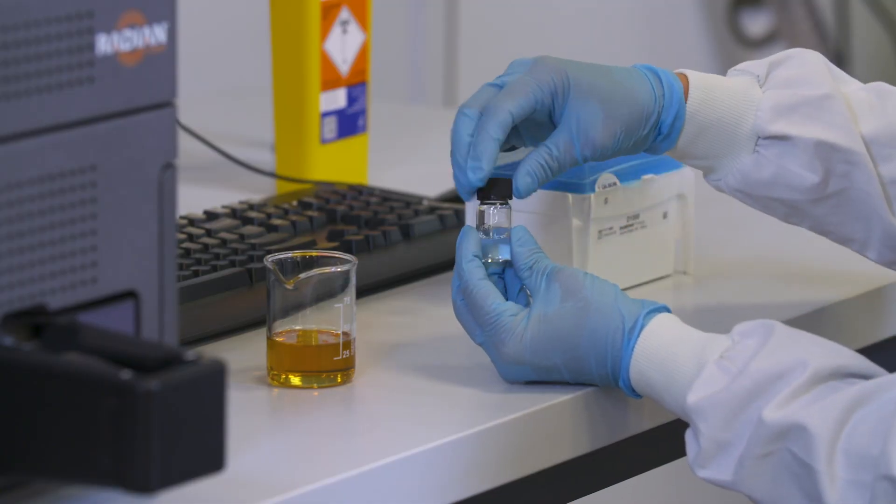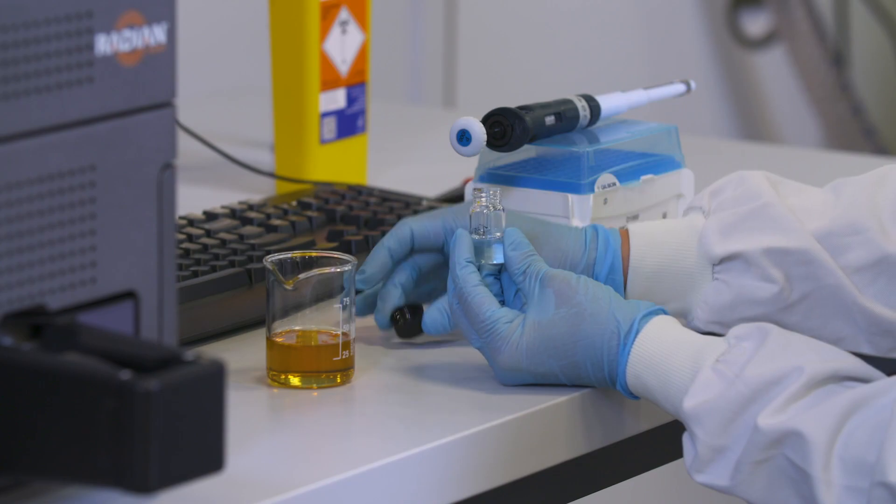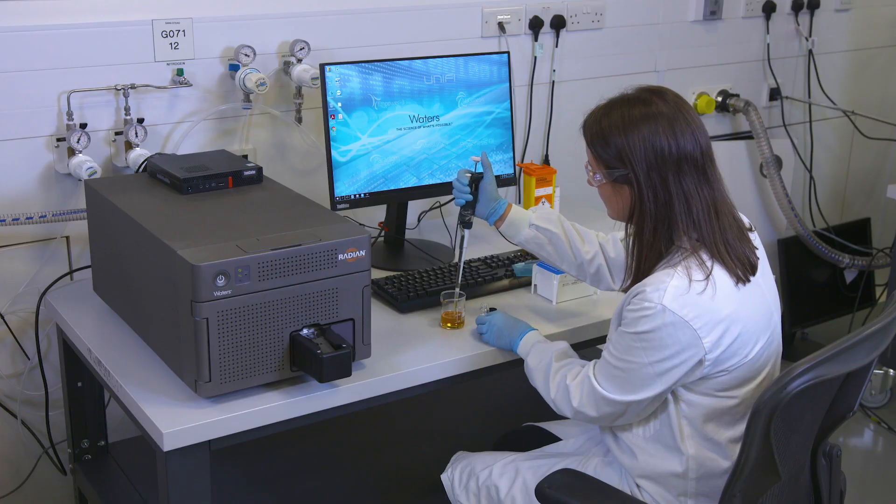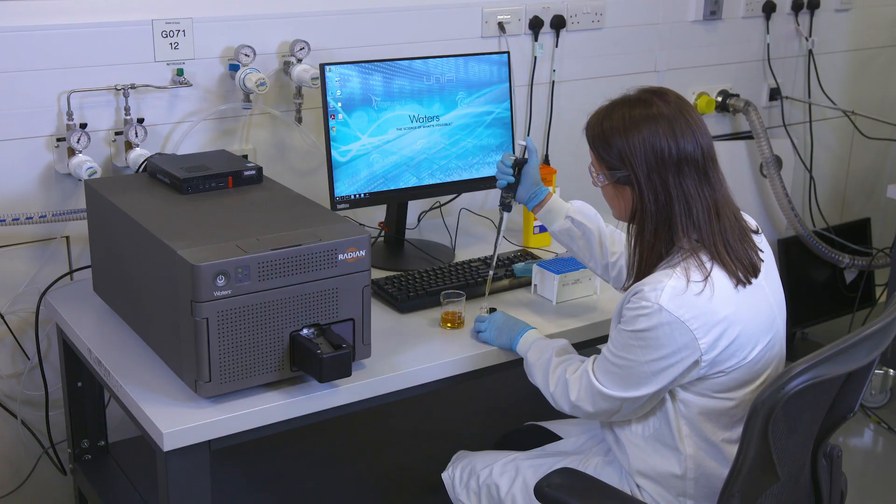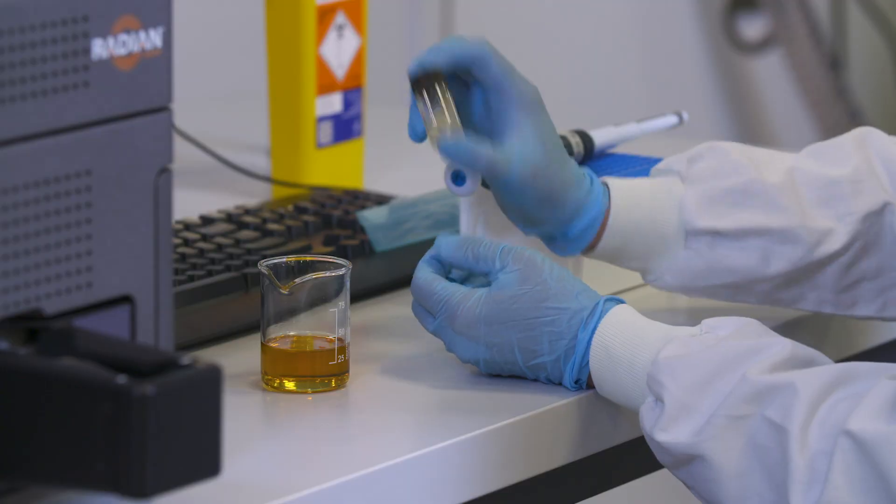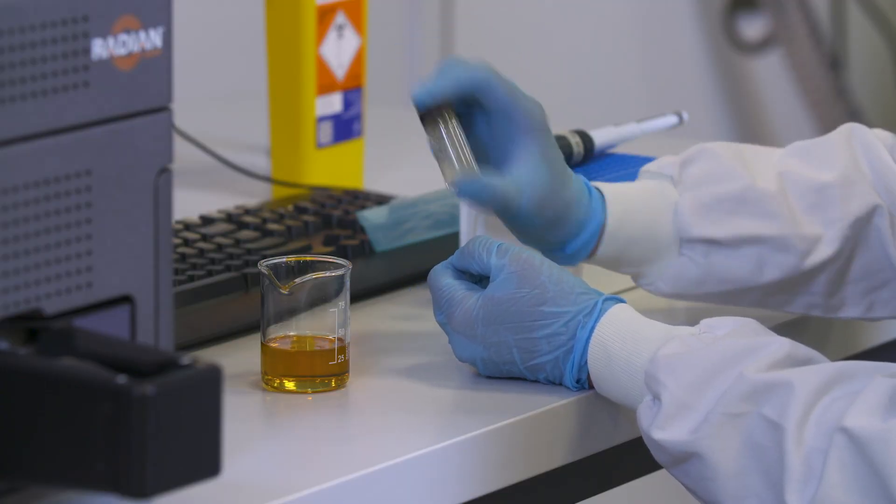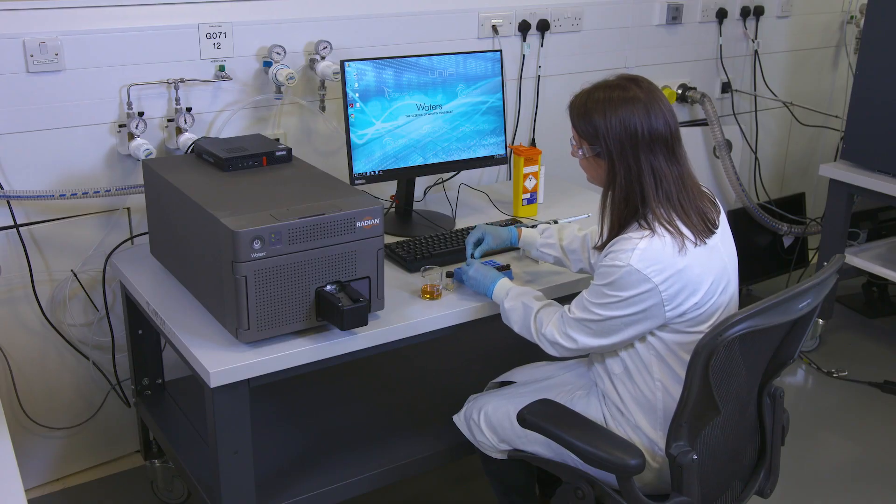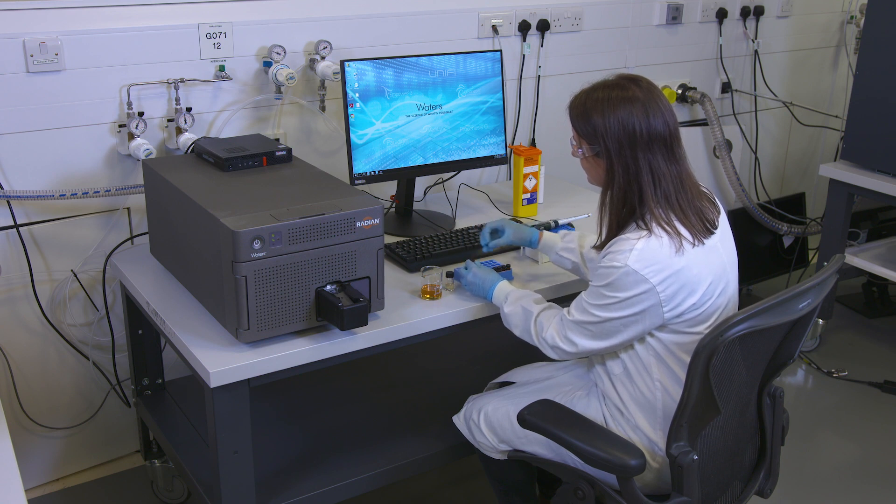With a quick and simple approach involving minimal sample preparation, users can acquire mass spectral data on which rapid decisions can be made without the need for time-consuming chromatographic LC-MS or GC-MS workflows.